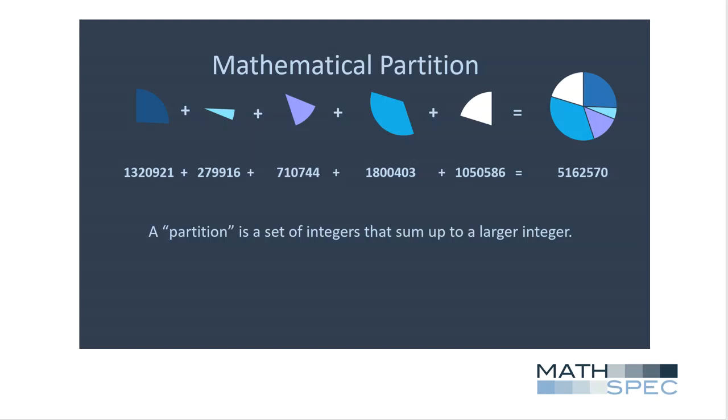The accurate masses here have been multiplied by 10,000 to convert the 4 decimal place rational numbers into integers. The Excel add-in checks for sets of 3, 4, or 5 masses that sum up to the accurate mass of the whole molecule. These are partitions of the analyte's accurate mass. This operation is CPU intensive, and it would be very difficult to do without using a computer. Scoring is based on how many individual fragment ions can be accounted for with various combinations of these subfragment masses and how intense those fragment ions are.